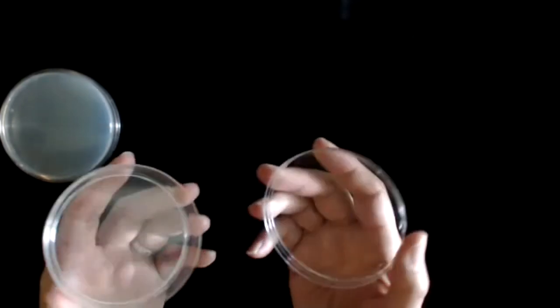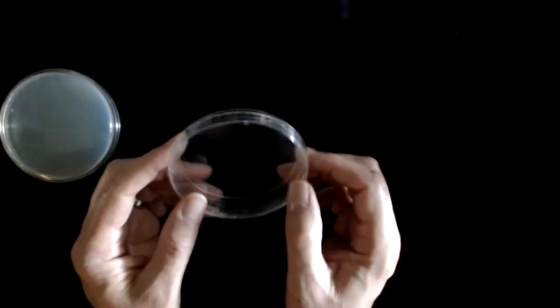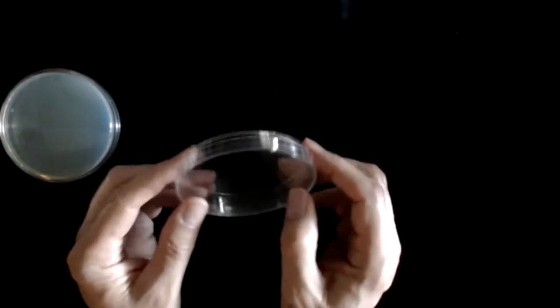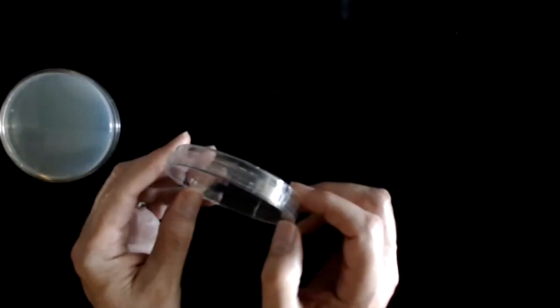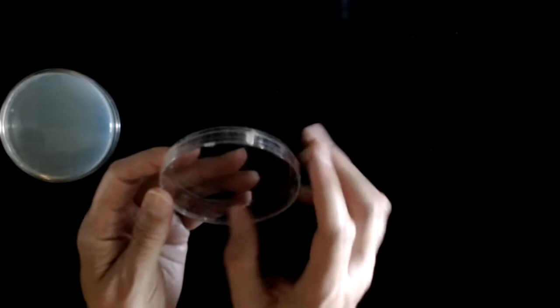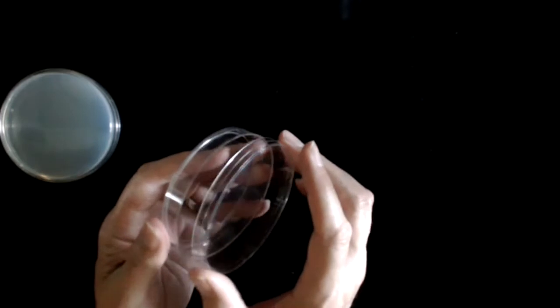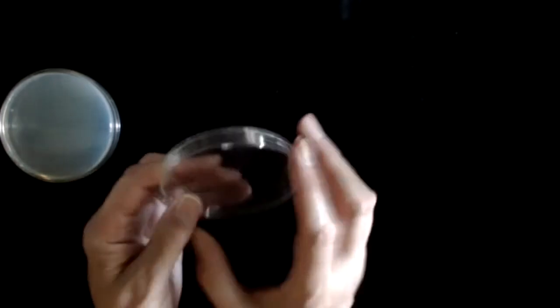is a device that uses a petri dish, which is composed of a bottom and a top that fits over the top of the bottom. This is a plastic petri dish. We buy this commercially, and when we receive petri dishes like this, they are sterile. There are no microorganisms, no spores, no viruses, nothing that could be alive or potentially alive is found on the inner surfaces of a sterile petri dish.